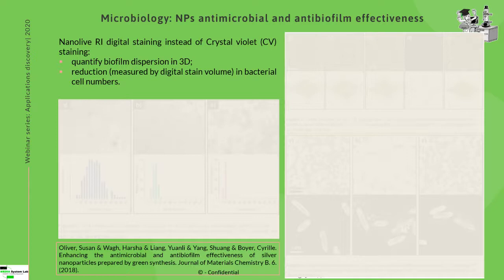And the second case is the effectiveness on the biofilm. So the biofilm is in 3D, and knowing exactly how much percentage of the biofilm is going to be destroyed with the nanoparticles is not easy at all. Because, for example, if you use crystal violet to make this estimation, crystal violet is absorbed also by nanoparticles. So crystal violet is not a good approach because it's going to give you a lot of false results based on the fact that nanoparticles are absorbing the color.